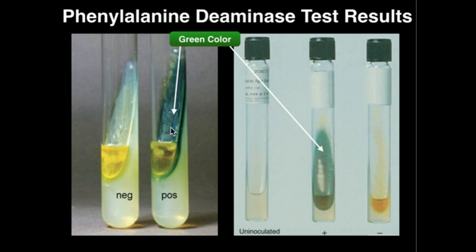However, you can see here we have a very dark greenish color developed on the slant. This is going to be a positive result for the phenylalanine deaminase test, indicating that we have either Proteus or Providentia. You can see the same results over here as well.